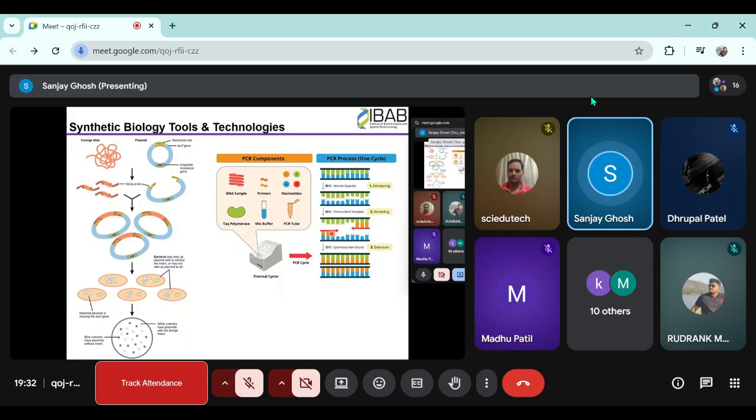And once you have these primers annealed, and there are usually one pair, two different primers, one is called a forward, one is called a reverse, right? So these two will bind and these will extend. There will be a 3' hydroxyl group here, and the DNA polymerase will simply extend both of them. And this is like DNA replication. You copy the template strand, right? And this is all about PCR that we have to know.